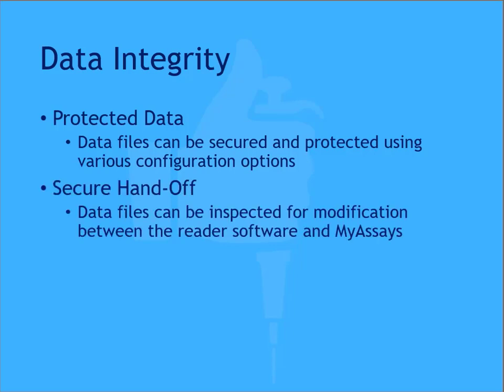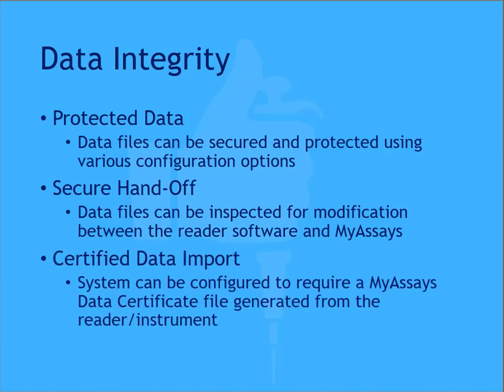MyAssays Desktop's secure handoff feature can check whether imported data has been modified since it was created by the reader software, with MyAssays Desktop blocking any modified files from import and logging such attempts in the audit trail. There are a number of ways this can be achieved, with the strongest and recommended method being the use of data certification. This ensures that all data files imported into your protocols have been created using the appropriate reader or instrument and were not imported from a different source or modified after creation.